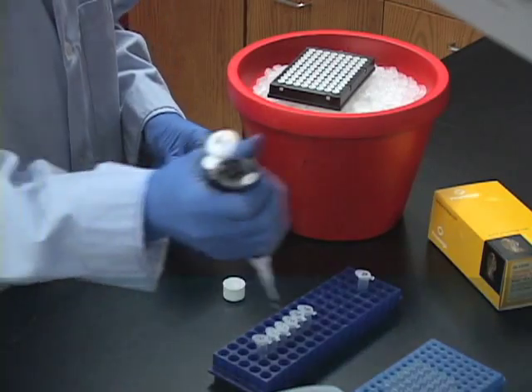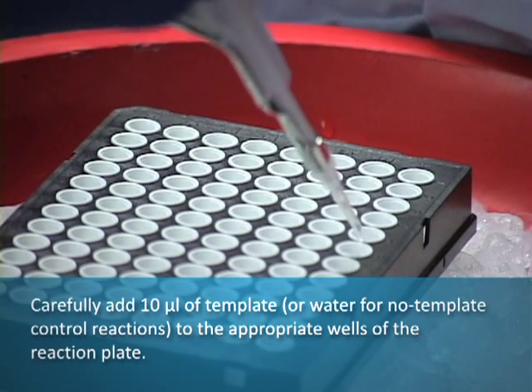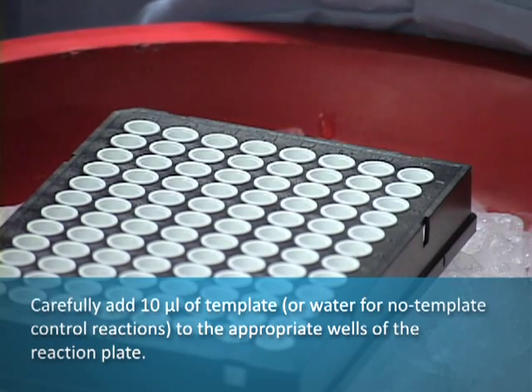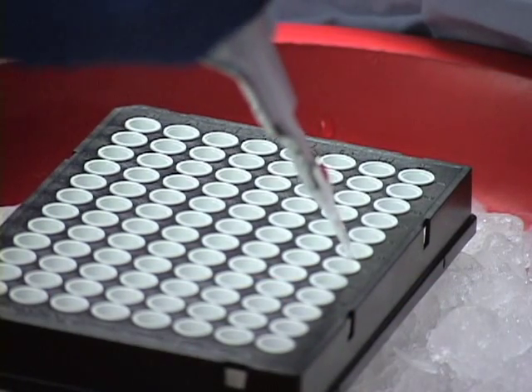Carefully add 10 microliters of template, or water for no template control reactions, to the appropriate wells of the reaction plate. Store the plate at room temperature or on ice.